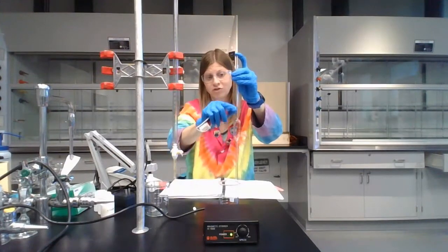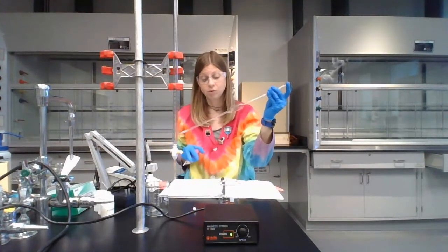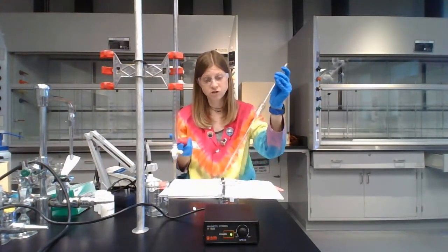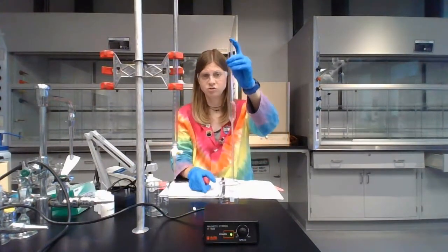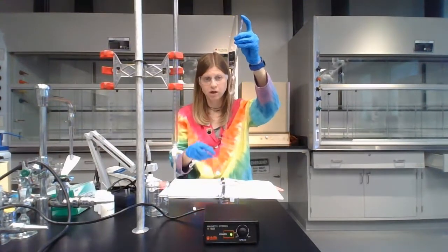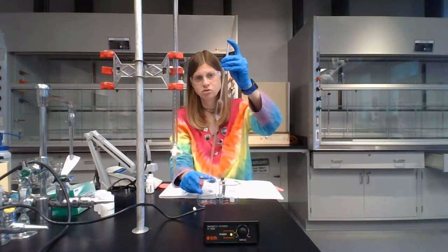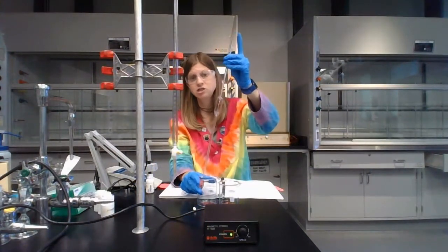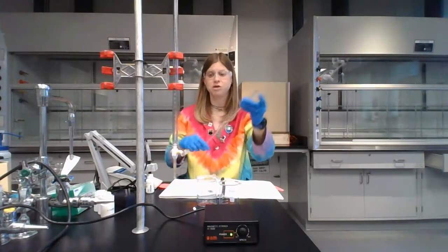So just like always, you're going to fill it above the line, and then when you condition, you're just going to let it all drain out. And then when you go to accurately transfer it, you will use your bulb to get the level of liquid above the line, and then use your finger to let the line fall to right at that 1 mark. And then you'll carefully transfer that 25.00 milliliters of liquid into beaker number 1. And then you'll repeat that for beaker number 2 and then beaker number 3.